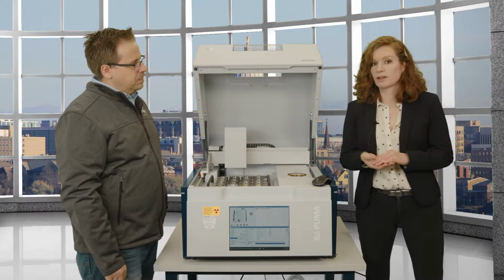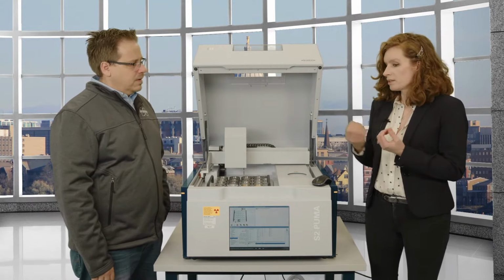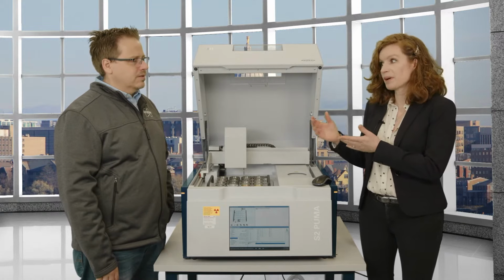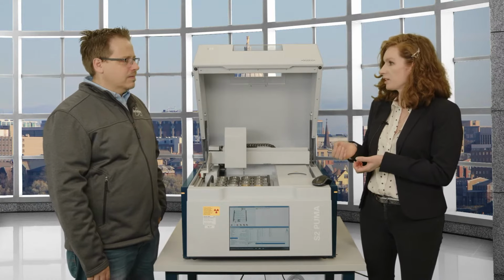We routinely work with our colleagues in XRD if they have some compound that they can't figure out what it is. They ask us to measure it, and then we can determine whether that element that they might think is there is really there or not, because we can get to lower levels of detection than they can.